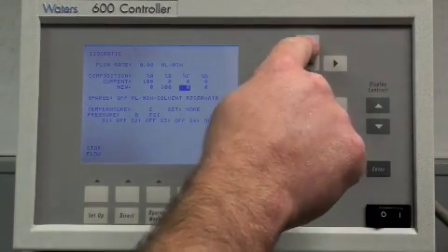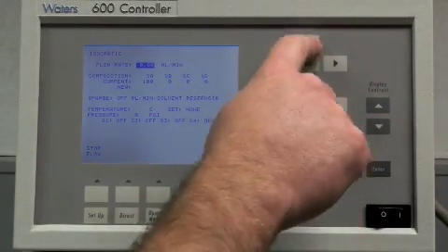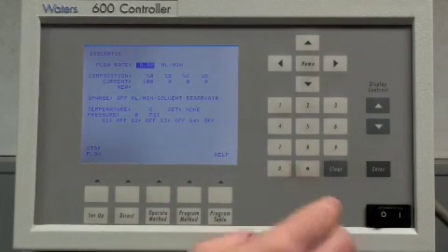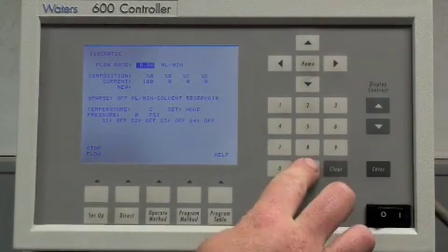Now, we get the pump operating by going up, back up to the flow rate, and entering in a value, say for example, 0.5 mils a minute.